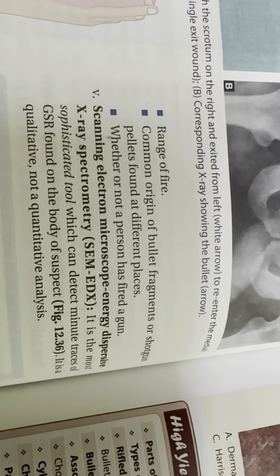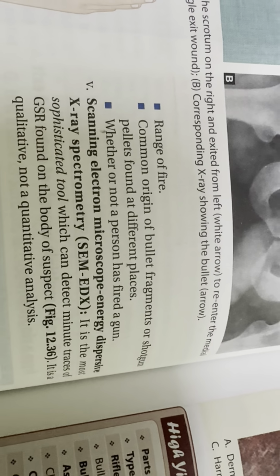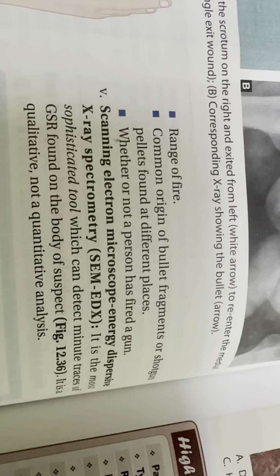Scanning electron microscope, energy dispersive X-ray spectrometry. SEM-EDX is the most sophisticated tool which can detect minute traces of GSR found on the body of the suspect. It is a qualitative and not a quantitative analysis. SEM-EDX, scanning electron microscope, energy dispersive analysis.